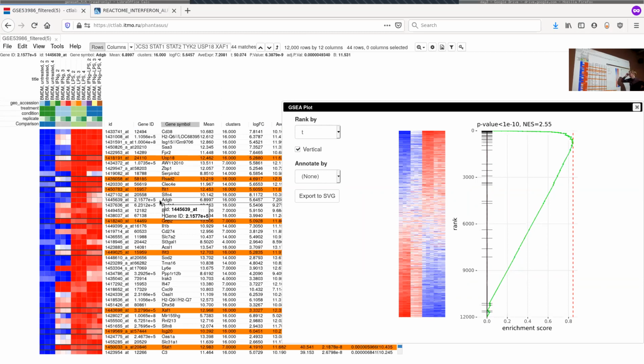On these genes we go to the right, proportionally to the T value. Then we go a bit towards the left again, for three genes. Then we have another gene from the gene set, so we go right and so on.